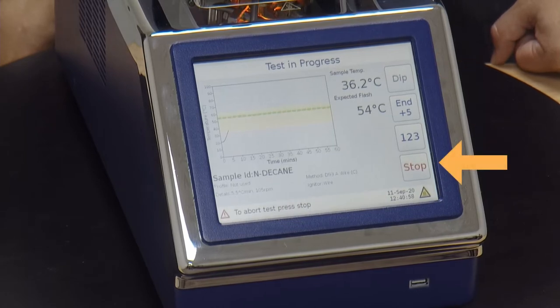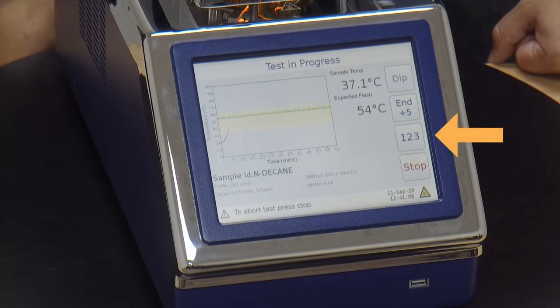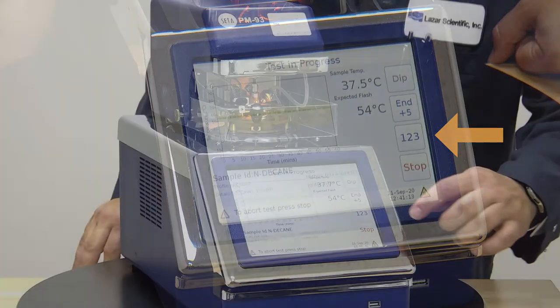The stop button will stop your test at any point. If you realize you've done something terribly wrong or mislabeled, you can stop the test. The button above it, the one two three button, takes you off the screen with the graph and small numbers and brings you to a screen with a large set of numbers.